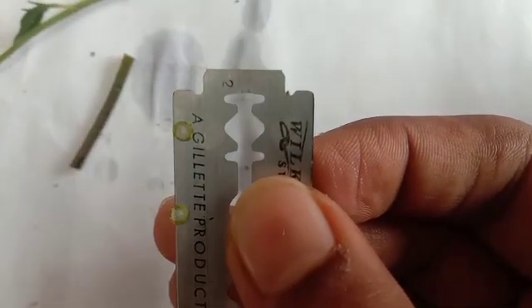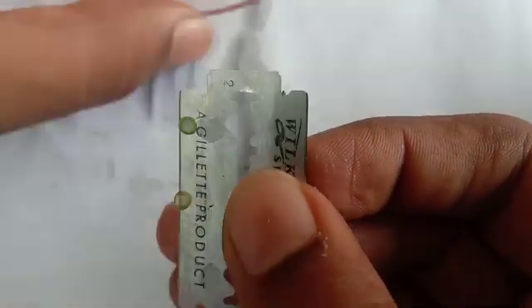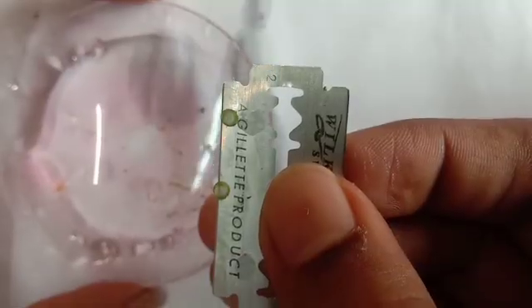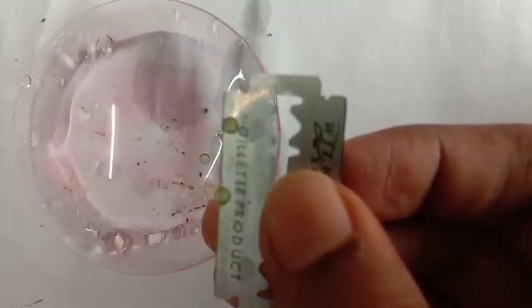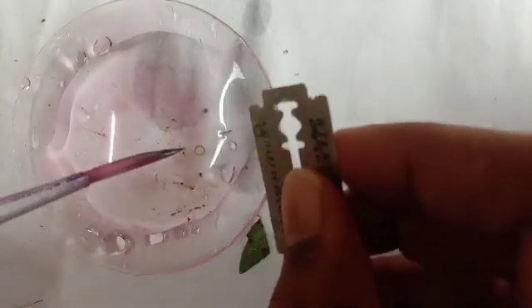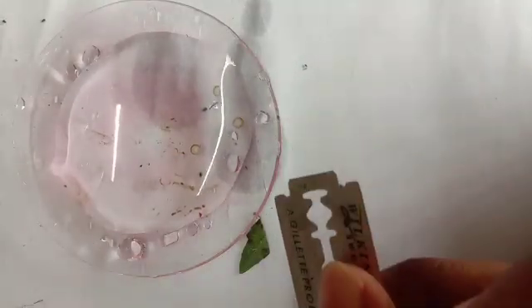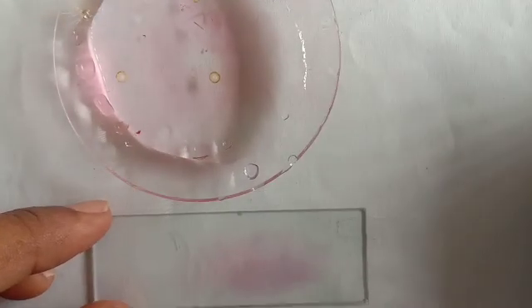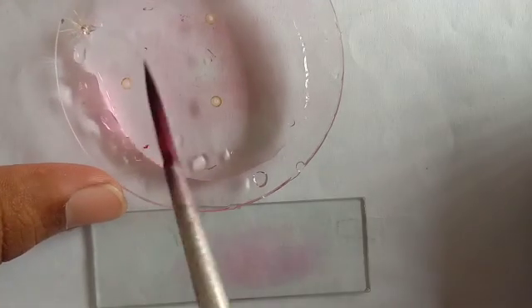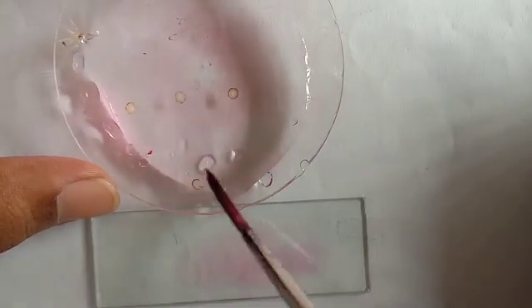Done. Now with the help of a brush, transfer this section to a watch glass containing water. Now take a clean slide and choose the thin section which you have to stain. I'm taking two sections here.